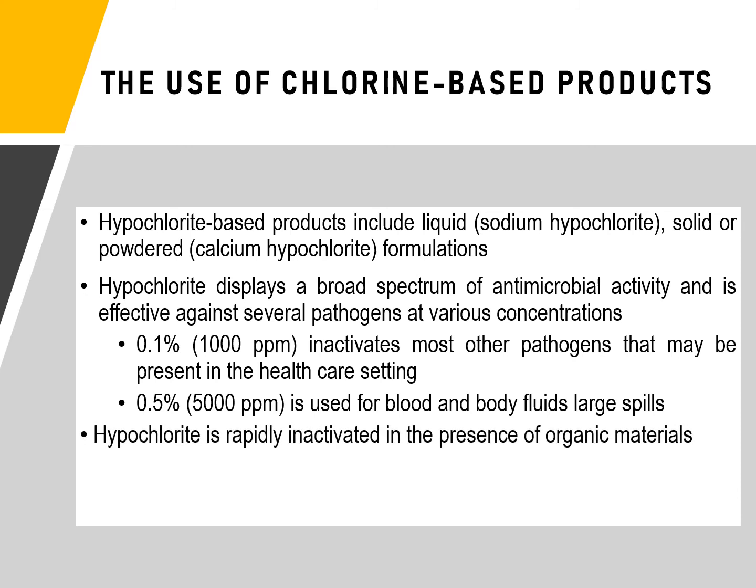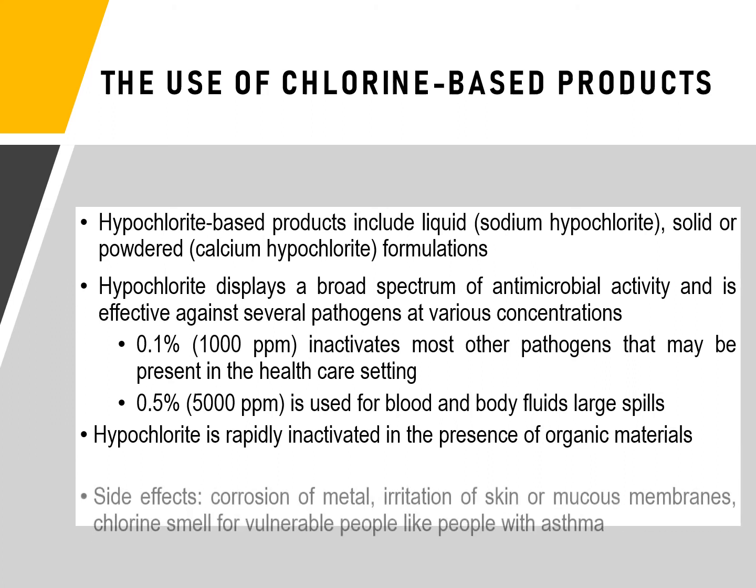Hypochlorite is rapidly inactivated in the presence of organic materials, but based on the previous bullet, in order for the hypochlorite to maintain its function or to improve its function, you have to increase the concentration of the hypochlorite solution.